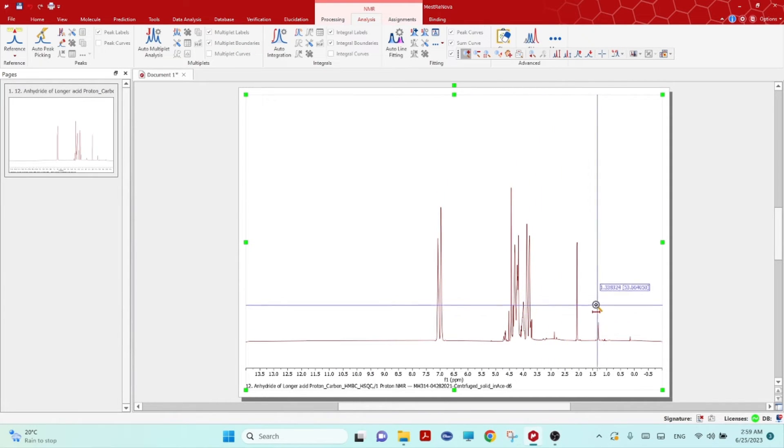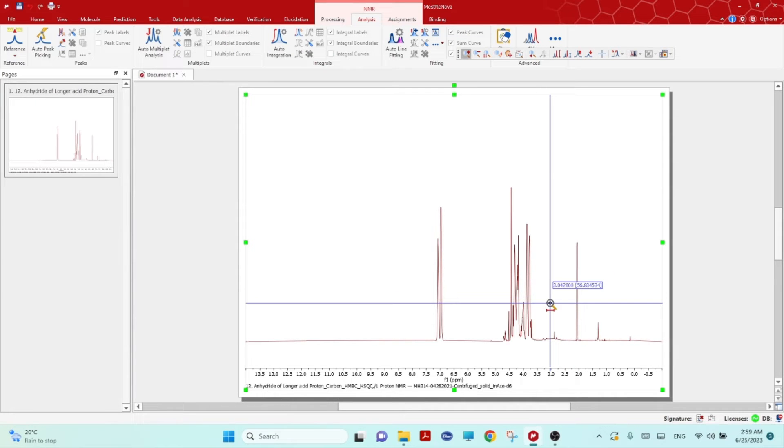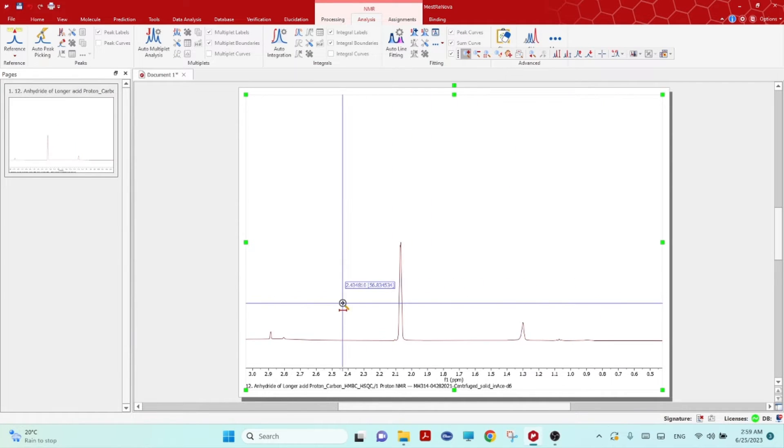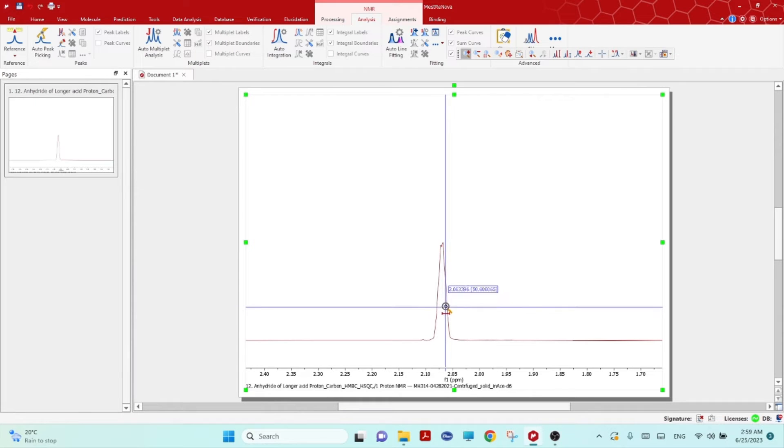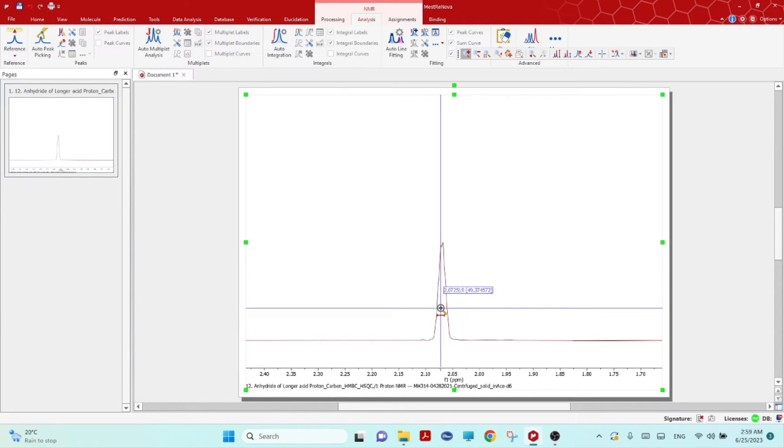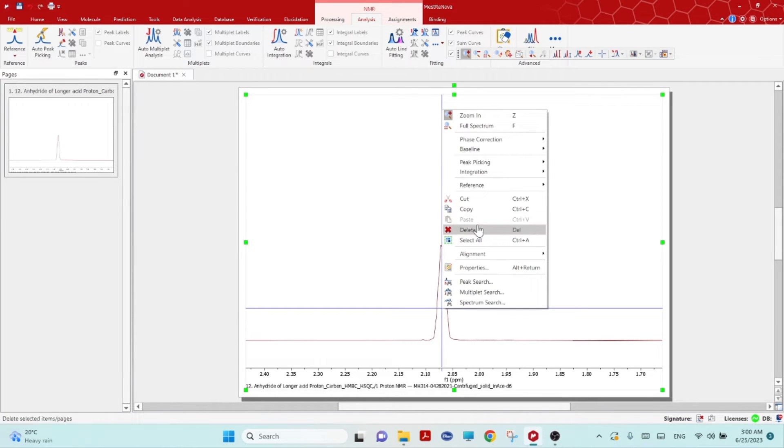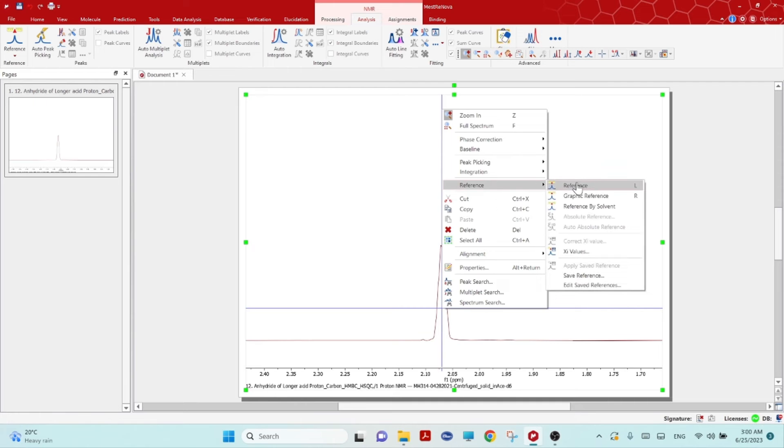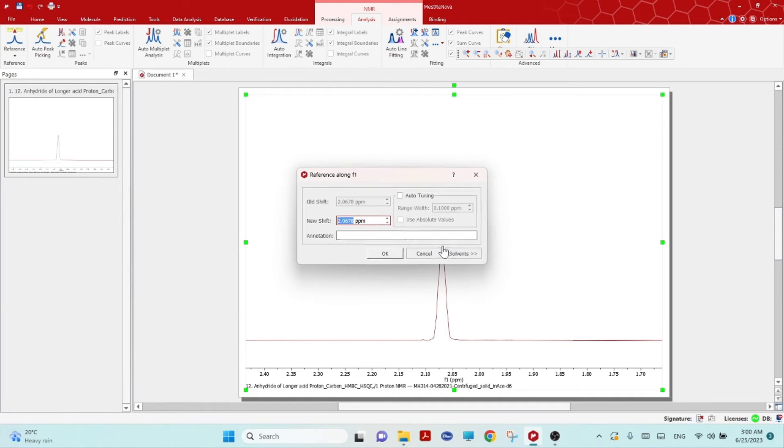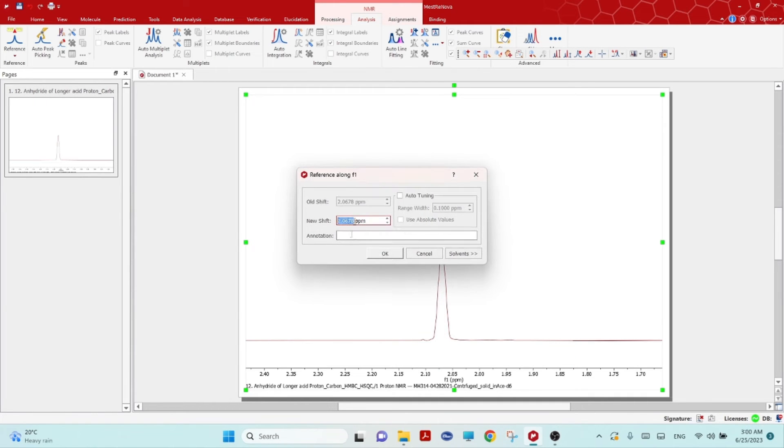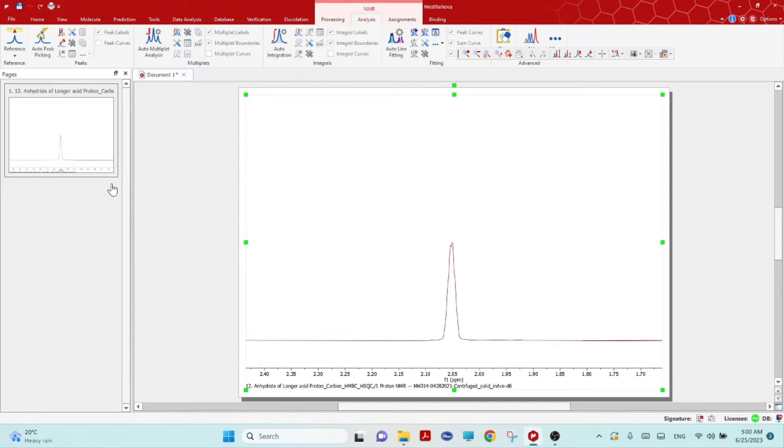Zoom this area. My solvent was acetone-d6, so here it is showing 2.06. You can right mouse click and go to reference and click on this peak and you can put 2.05, that is the acetone peak. Click OK.